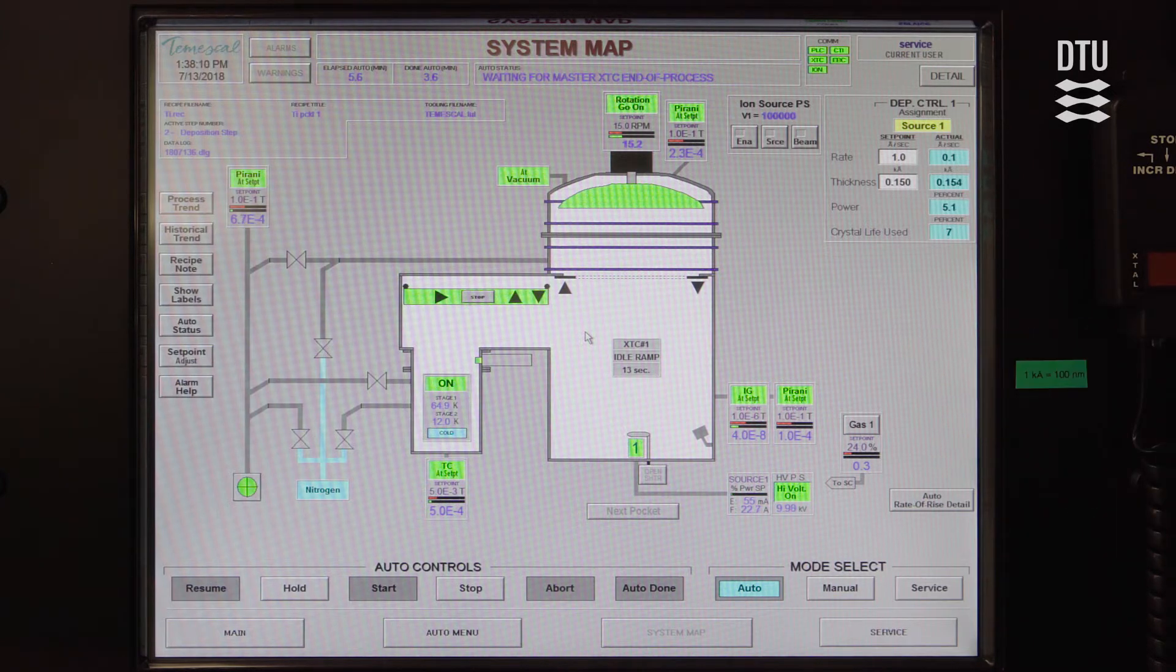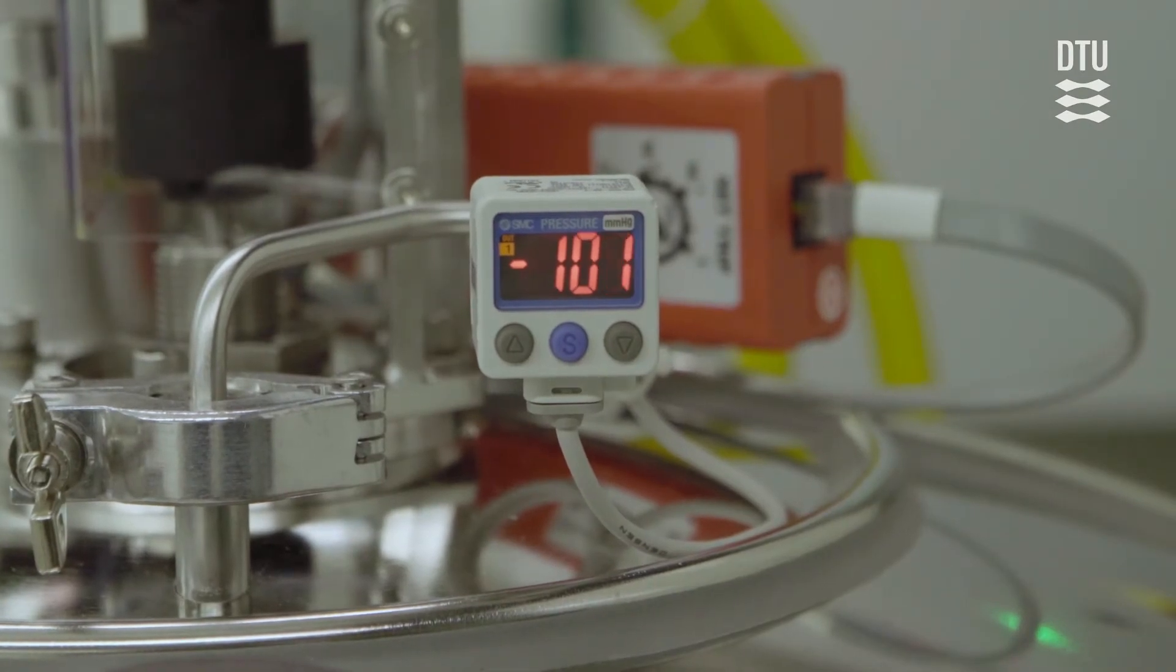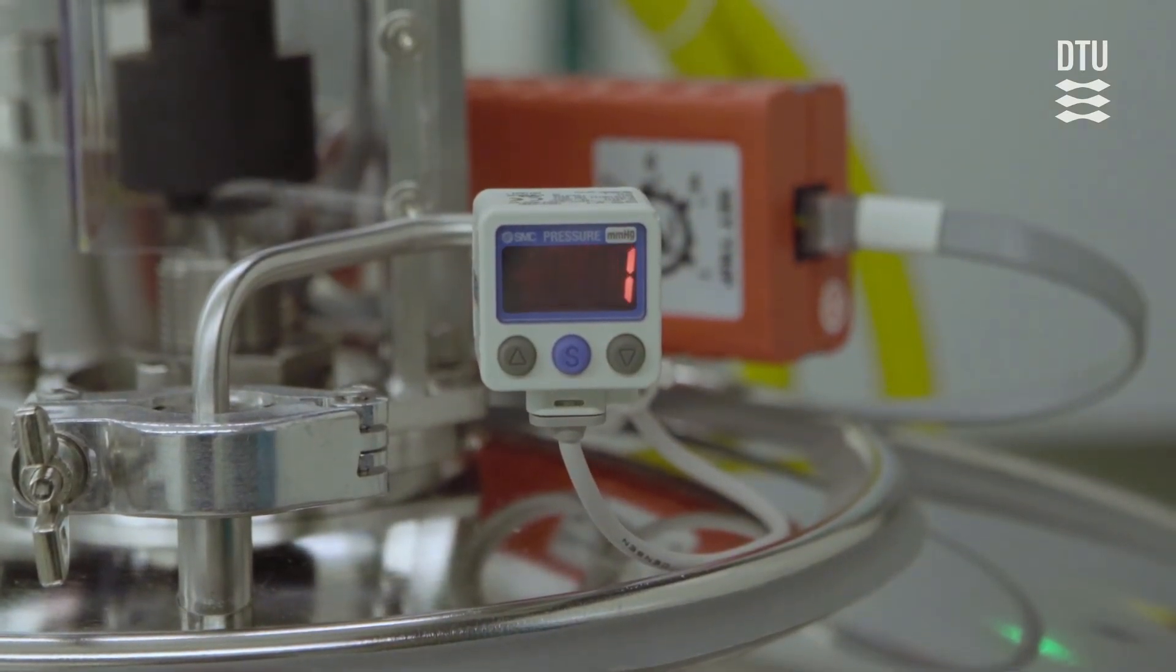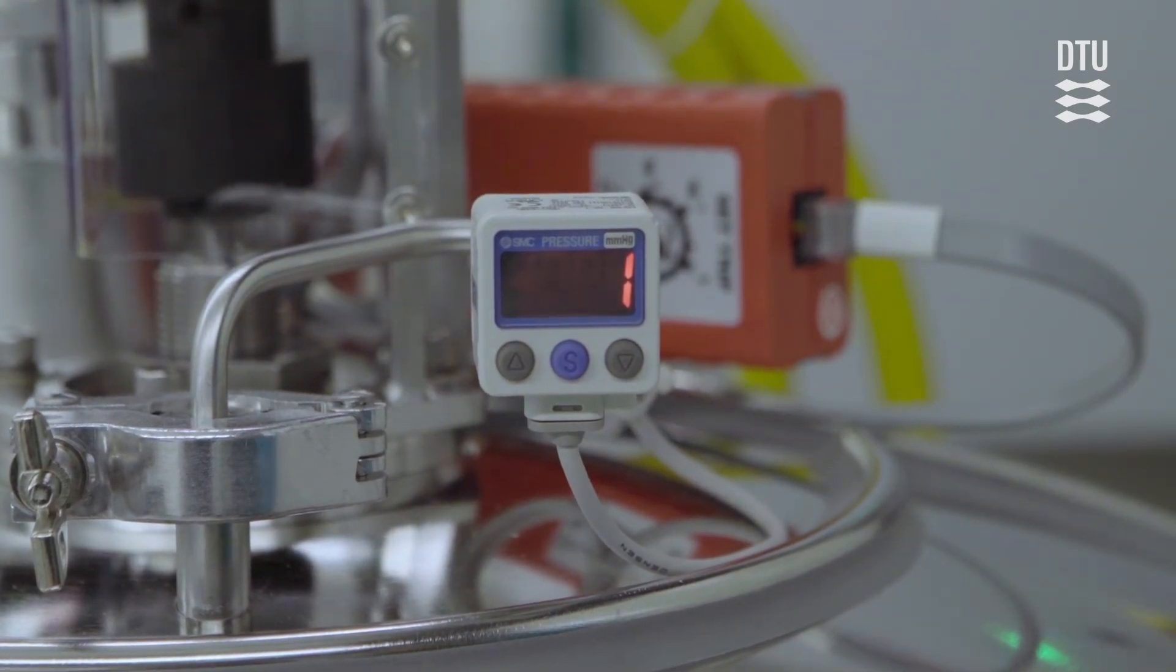So now the source is powering down and then afterwards there will be some cool time where the wafers have a chance to cool off a little bit. Because then in most of our recipes, in all the standard recipes, the load lock will vent automatically after the deposition. Yes, so now that we're venting the chamber, we see that the pressure is rising and the high-pressure pressure gauge on the outside of the chamber.